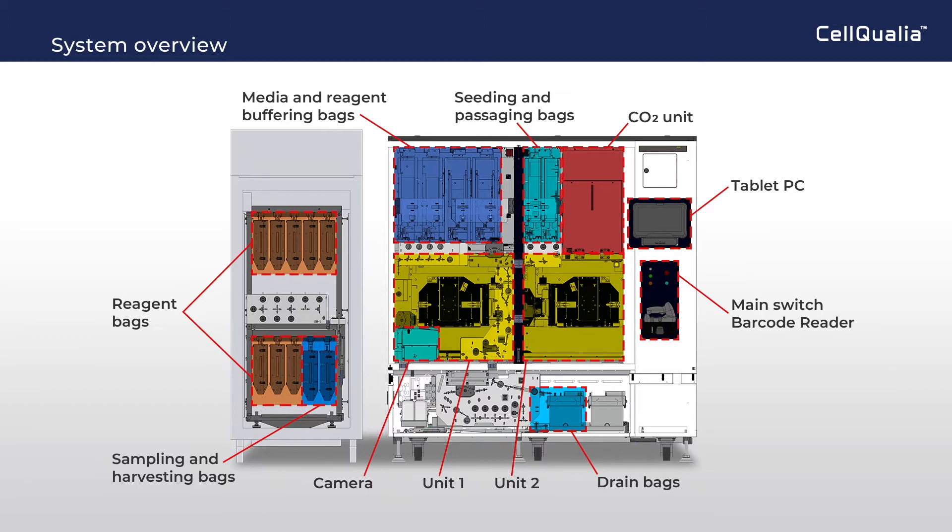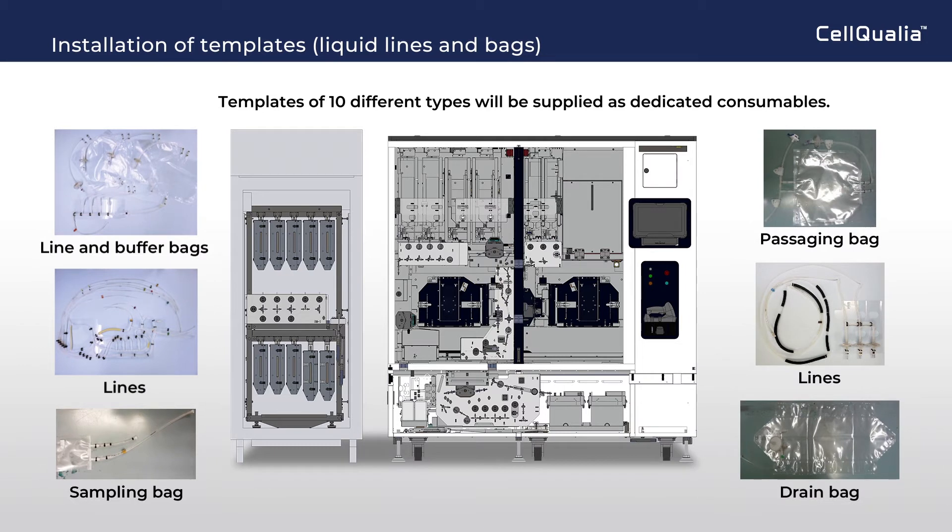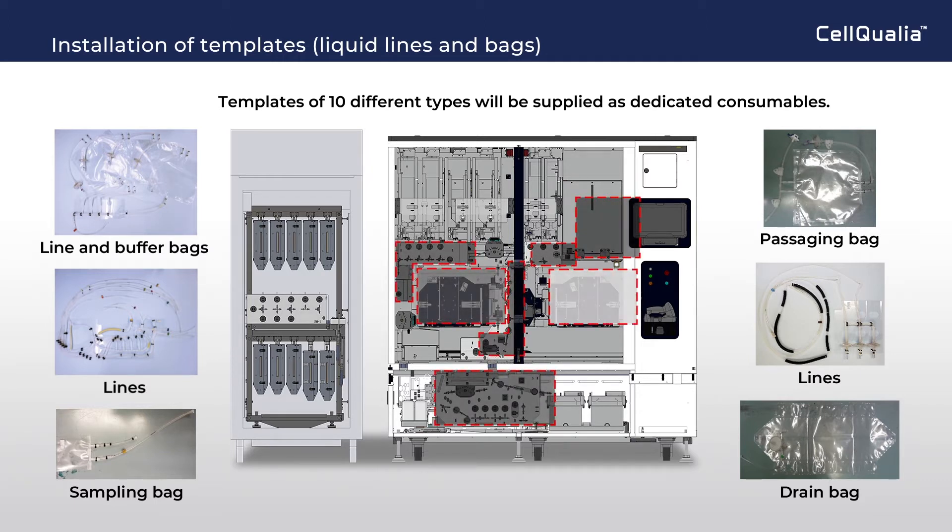A fully closed system is one of the important features of this system. For users' convenience in installation, tubing and bags are set to a reinforcing template. An appropriate setting of 10 templates and flasks, and aseptic connecting lines, makes a fully closed liquid transfer system.